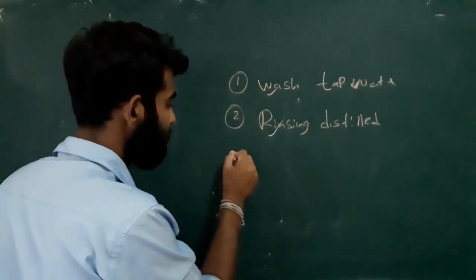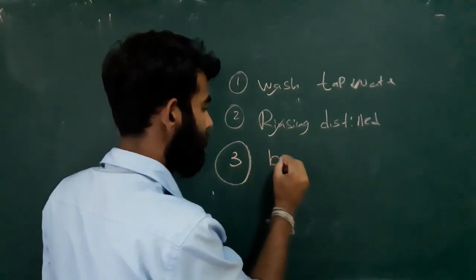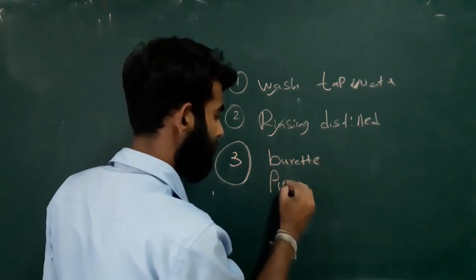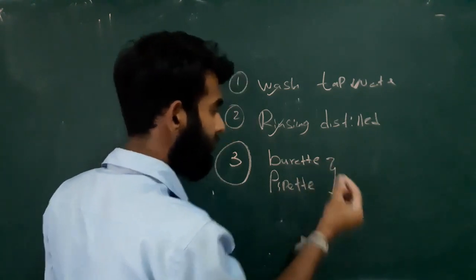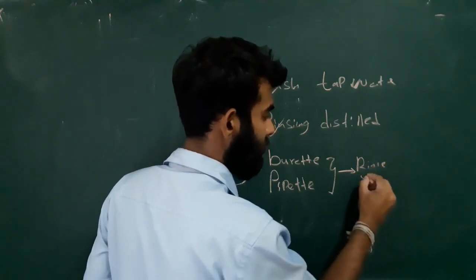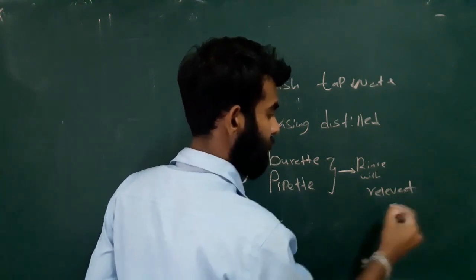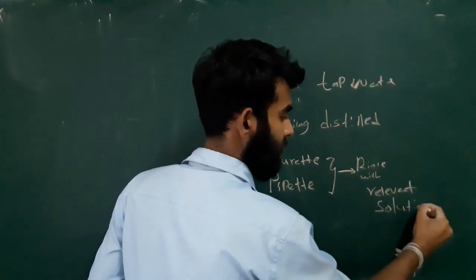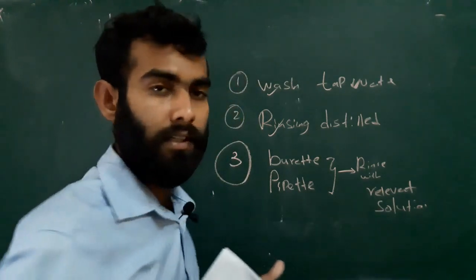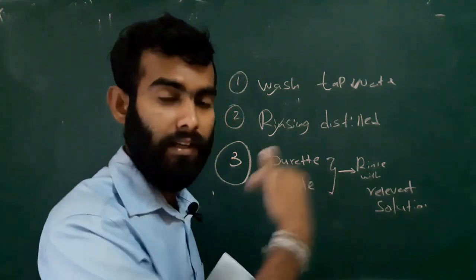When we are using very special things, like burette and pipettes, these things we have to rinse with the relevant solution. What we are going to add, what we are going to measure with this glassware, we have to rinse the glassware with that solution.